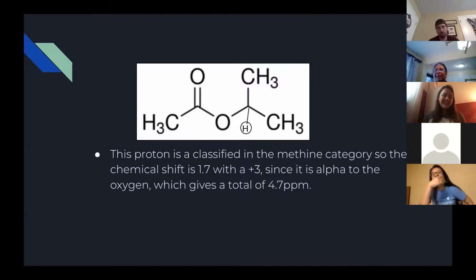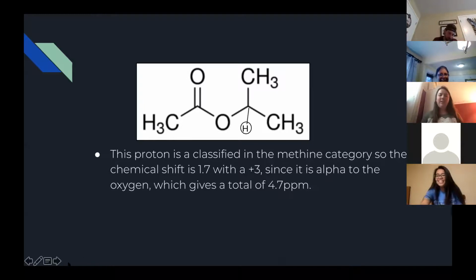Oxygen of what functional group? You said ester. Ester. Okay, all right. Thanks. Good job, Jamie. So, yes, because it is alpha to the oxygen of the ester, we add 3.